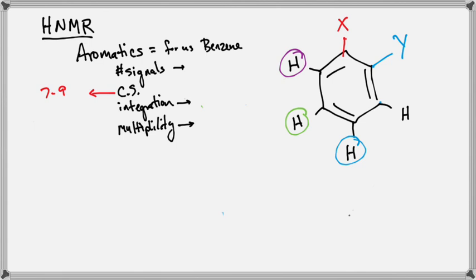And then we've got that hydrogen. Is it different? Yes. Which means how many signals? 4 signals. What's our integration? It's going to be 1 to 1 to 1 to 1. Nothing special about them. They're all just single hydrogens.